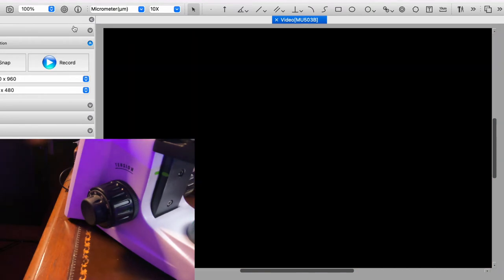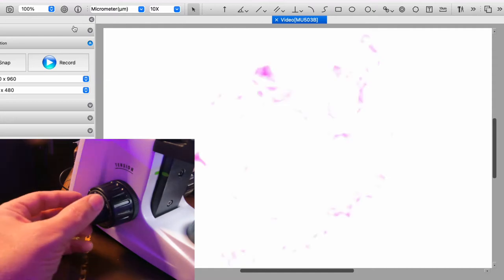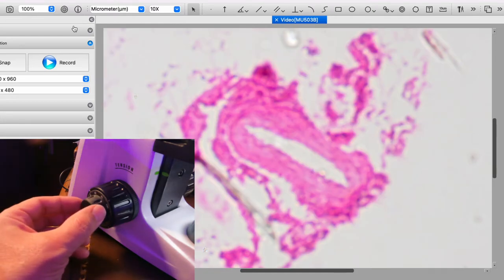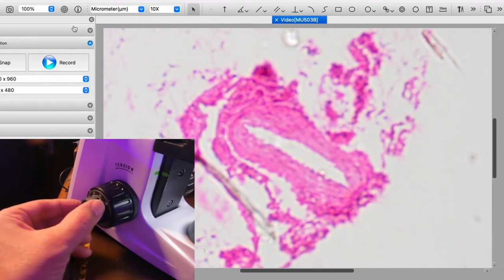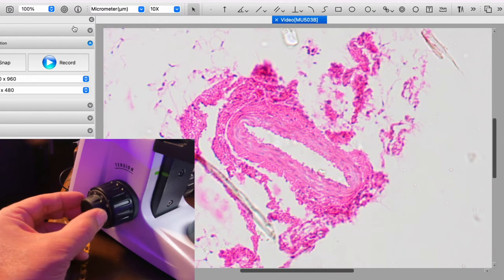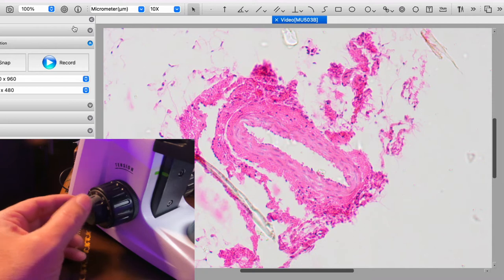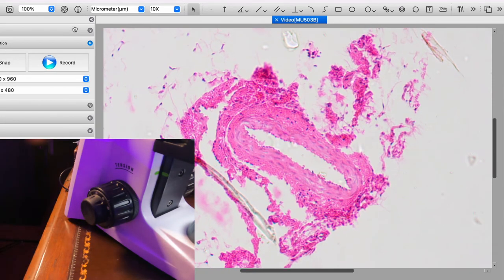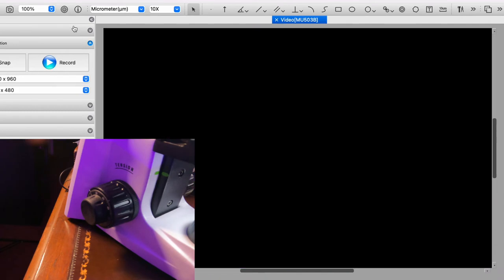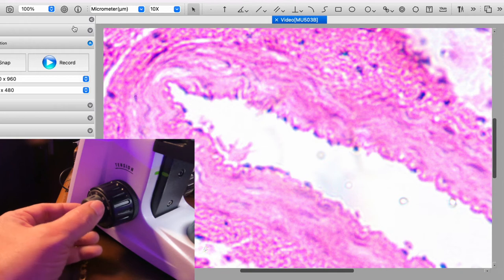Now I'll switch to the 10x lens. And here we want to see what small movements I need to make. There we go. Maybe an eighth of a turn, but not much to get it into focus. Now we'll go from the 10x objective up to the 40x objective.